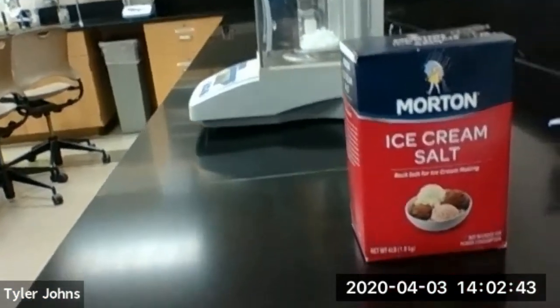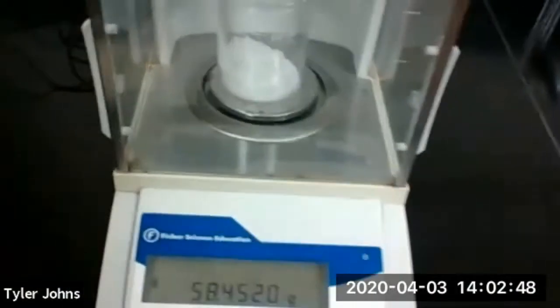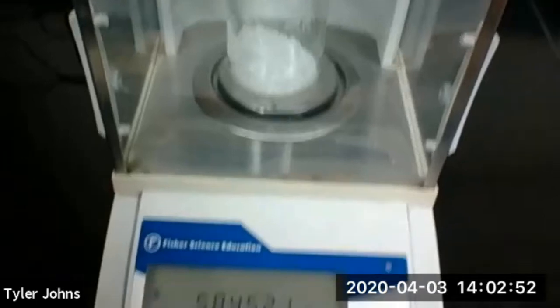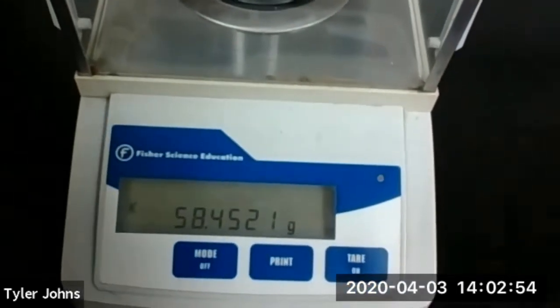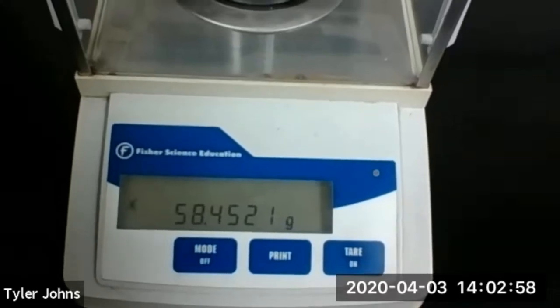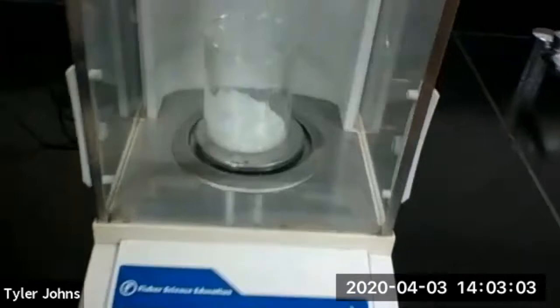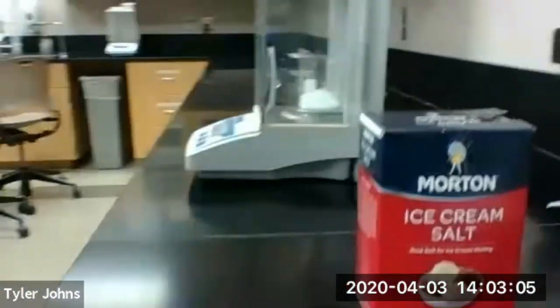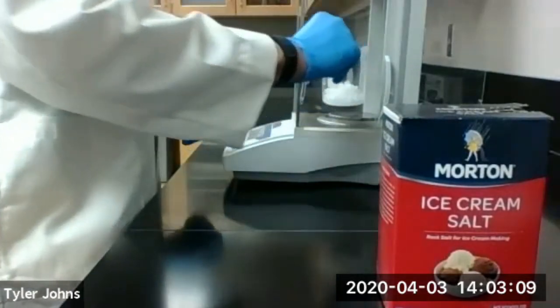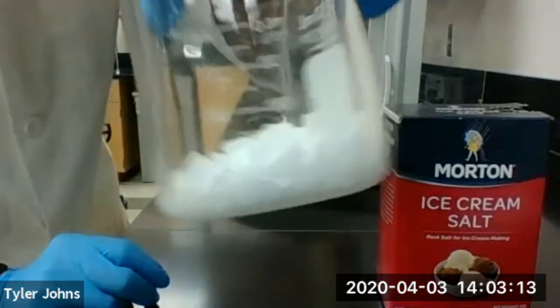Okay, so we've measured out approximately 1 mole of salt. Here's our beaker with the rock salt. And the weight, we're at 58.4521 grams, just over 1 mole. Here's what 1 mole of rock salt looks like.